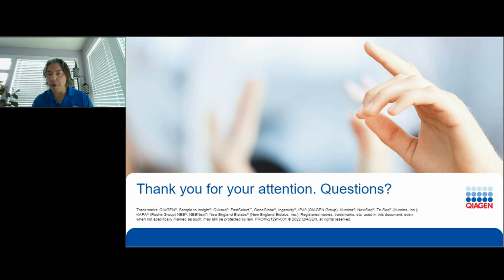Yep. A couple other questions in here about single-cell RNA-Seq. At QIAGEN, we've used this with the QIAseq single-cell RNA library preparation kits. We've just put that data into the most recent handbook. We use it at what we would call 0.1x or 0.01x, where we're diluting it down 1 to 10, 1 to 100, or 1 to 1,000. I believe about a 1 to 100 dilution or more works exceedingly well with trying to get a full transcriptome out of single cells with the method we're using.